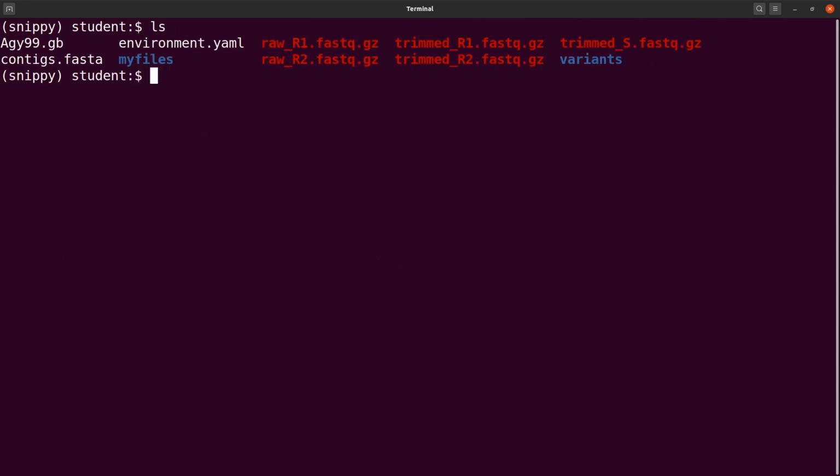And now we are going to do the variant calling. We are using Snippy. For Snippy, we use the --ctgs flag instead of R1, R2. So we will say snippy, let's use --cpus 8. Let's specify the output directory, this time let's use variant2.